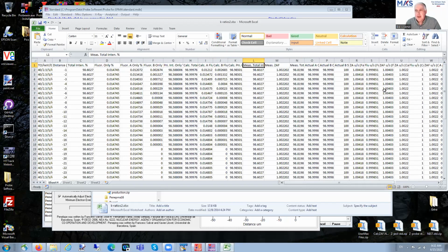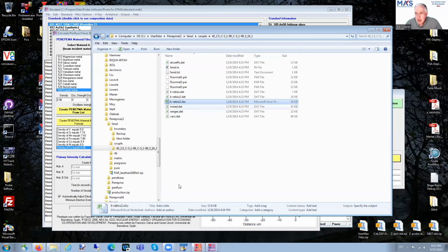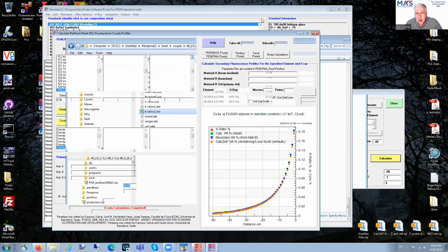All right, excellent. Thank you, John. Nicholas is going to join us again because there's an optimization tool he wanted to relay to everyone, and where to get help videos and all that. Sounds good.